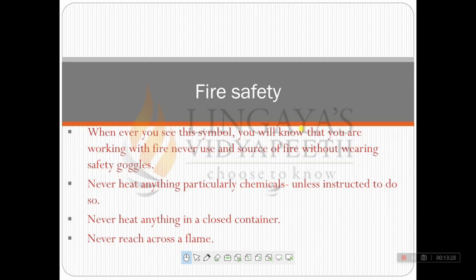Now talking about fire safety. So what is fire safety? The safety measures that you take for preventing any kind of fire come under fire safety. So whenever you see this symbol of fire safety, you will know that you are working with fire.